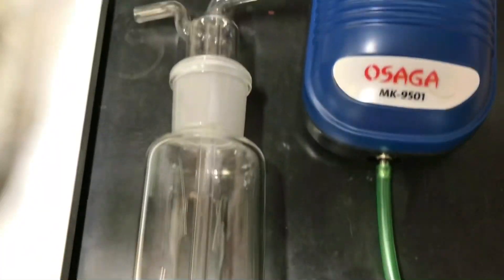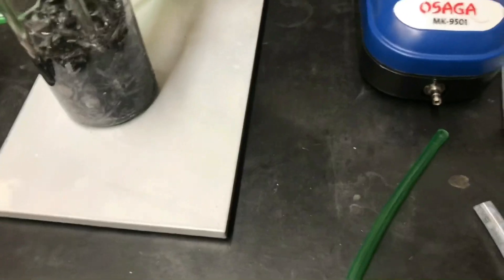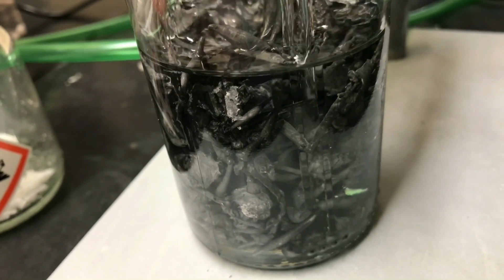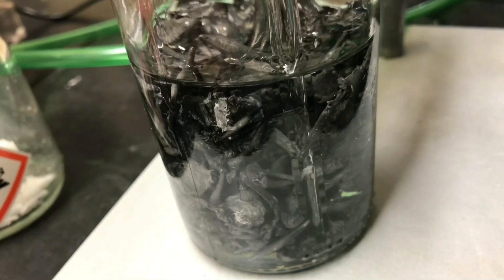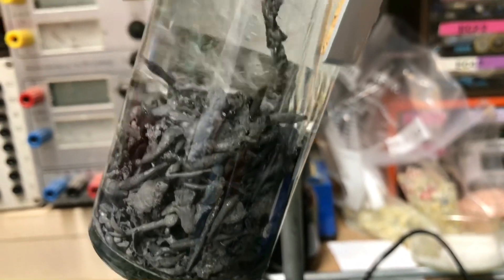A laboratory-grade gas washing bottle could of course also be used as the reaction flask. The next morning the pipe started to clog up, so I disconnected the pump and connected a syringe instead. By pushing back air and sucking some acetic acid through the tube, it was perfectly cleaned and air could flow through again. Later, more dilute acetic acid was added and the bottle was tilted to increase the bubble surface area through the lead, which inevitably speeds up the reaction.